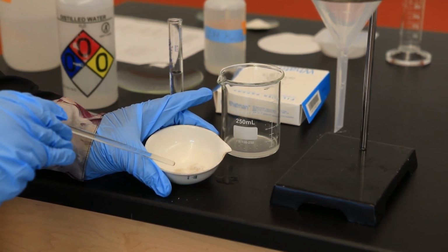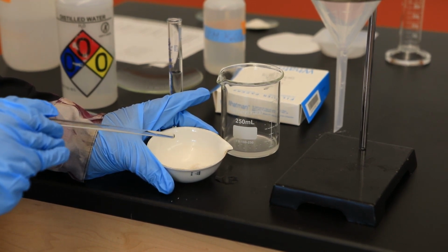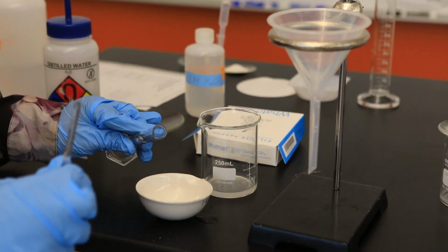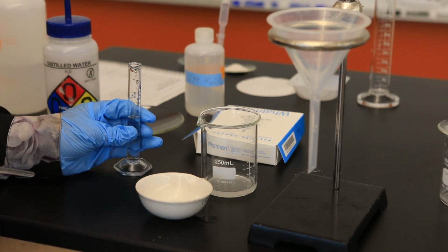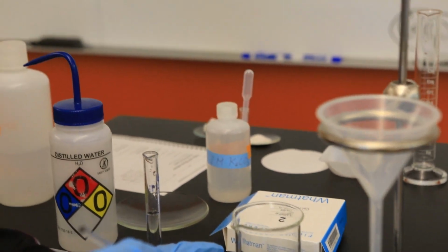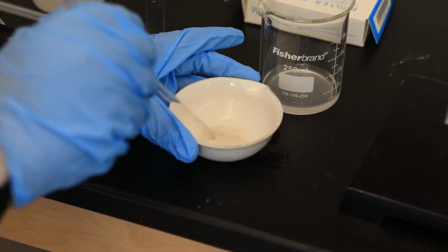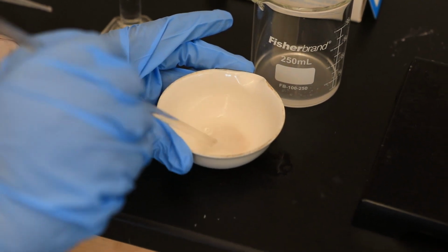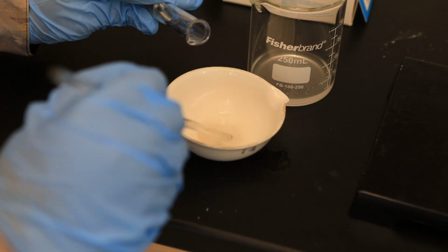I'm using one of the chemical properties of calcium carbonate to separate or isolate those two components. This would involve adding 8 mLs of hydrochloric acid. I'd be very careful as I add the hydrochloric acid. Why is that? Because when hydrochloric acid reacts with carbonates, what do we produce? We produce the gas CO2. So I want to make sure that there's no splattering, so it's very important that we add this slowly.